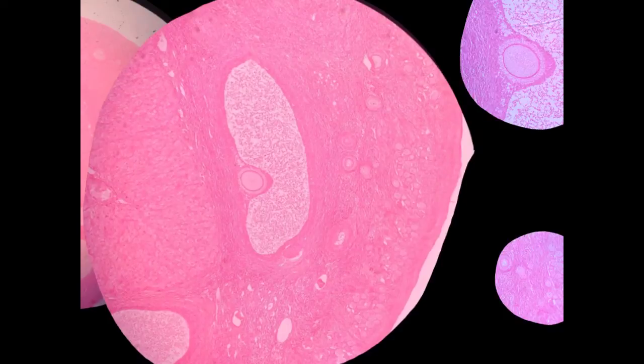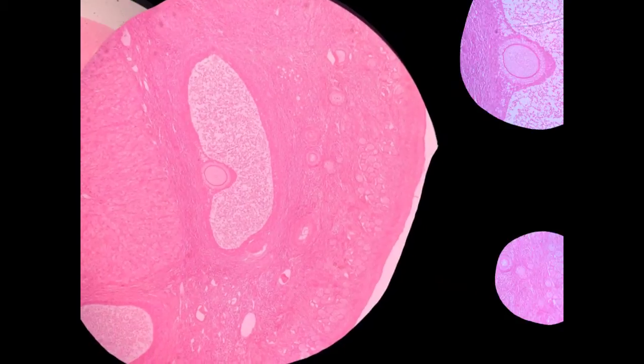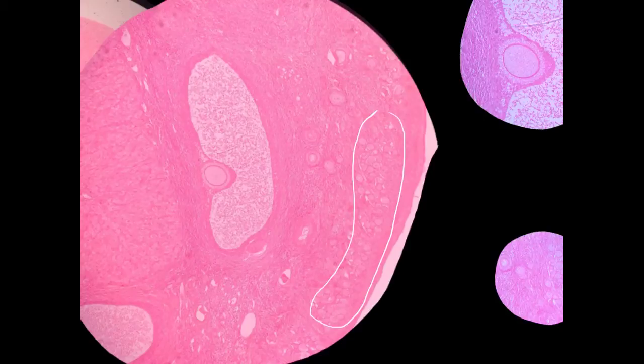The Graafian follicles are the biggest structures. In this same picture, you can see fairly well these primordial follicles all clustered right along here.